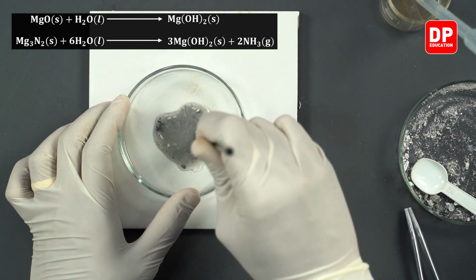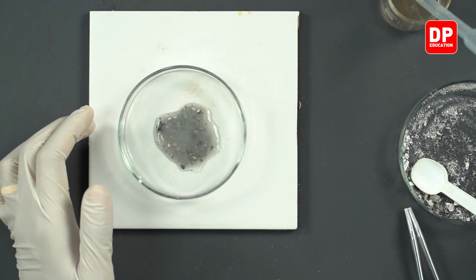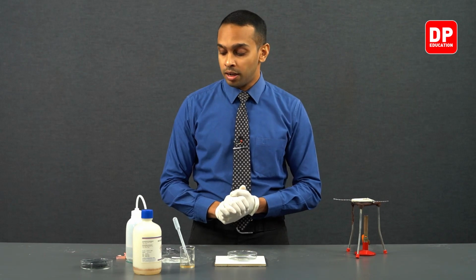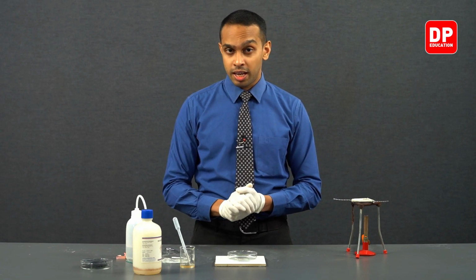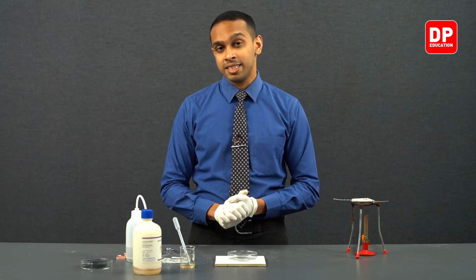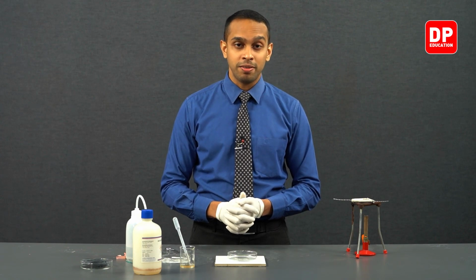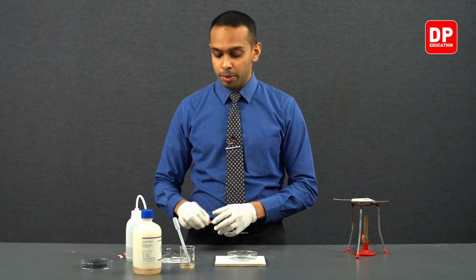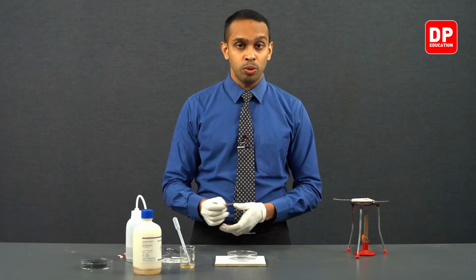and we can observe the pH of this solution that is formed with the use of a litmus paper. If the solution is alkaline or basic, the red litmus paper we have with us should turn blue.